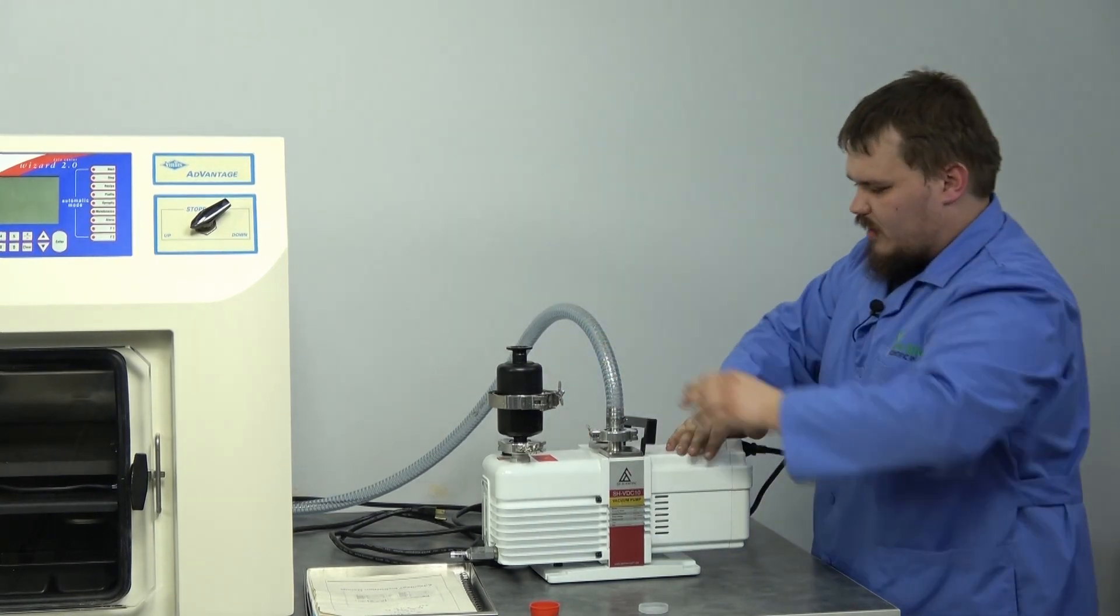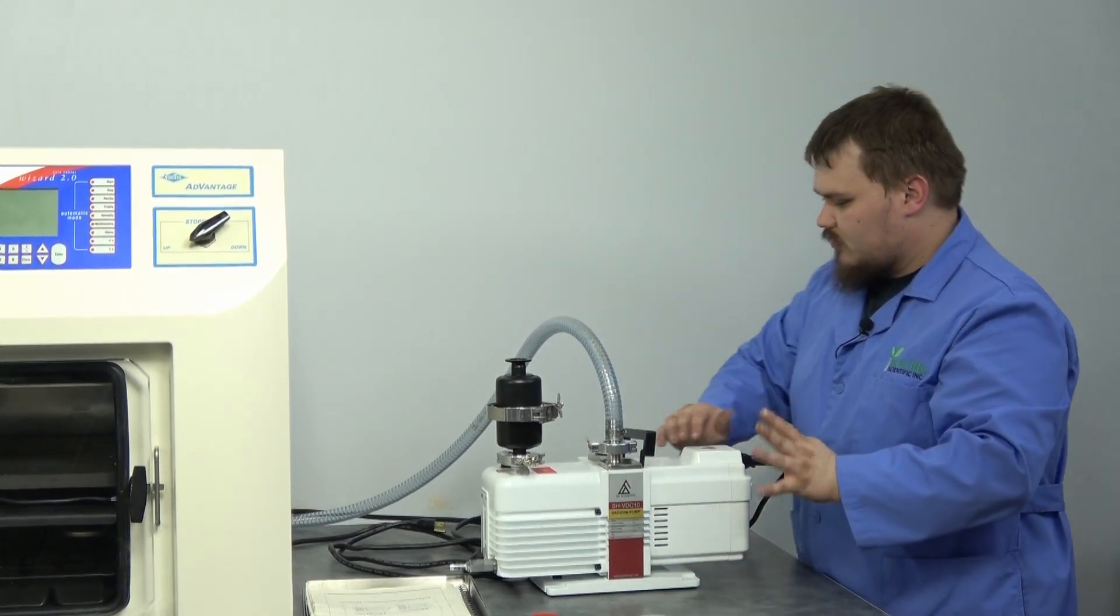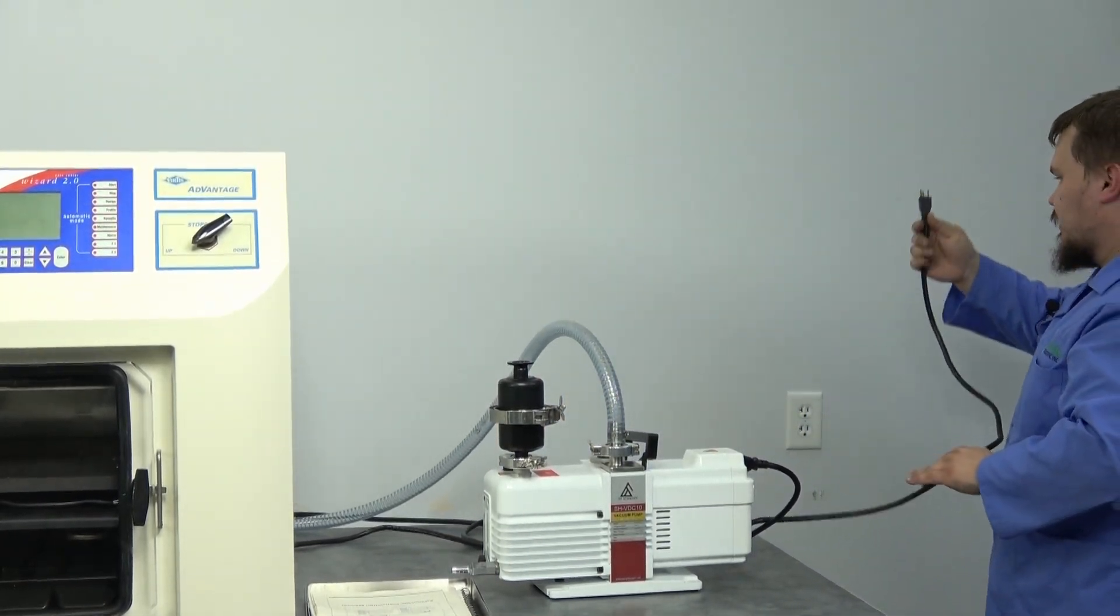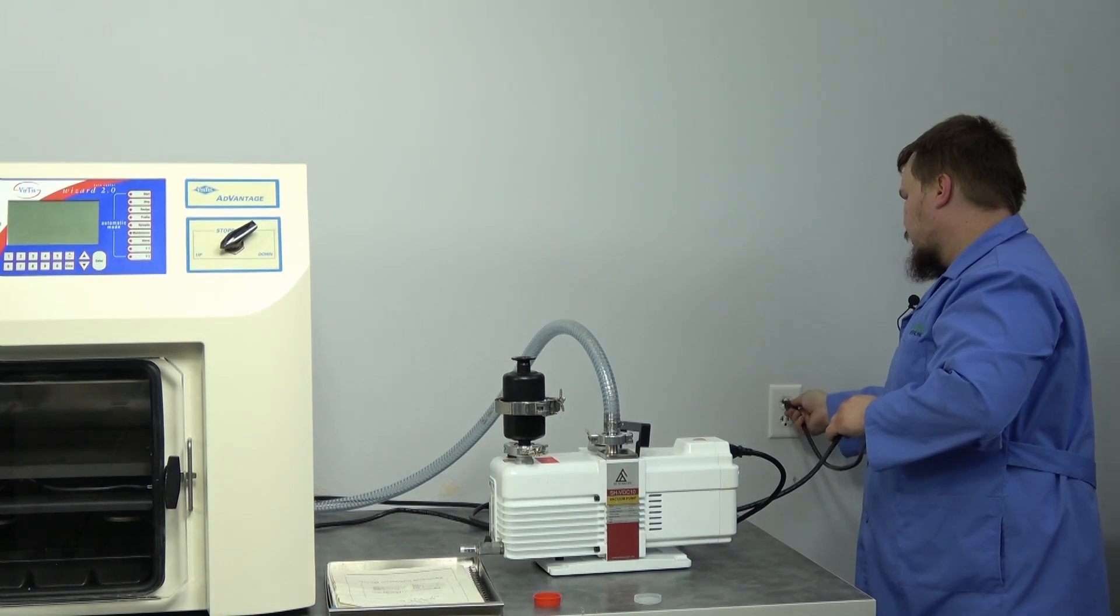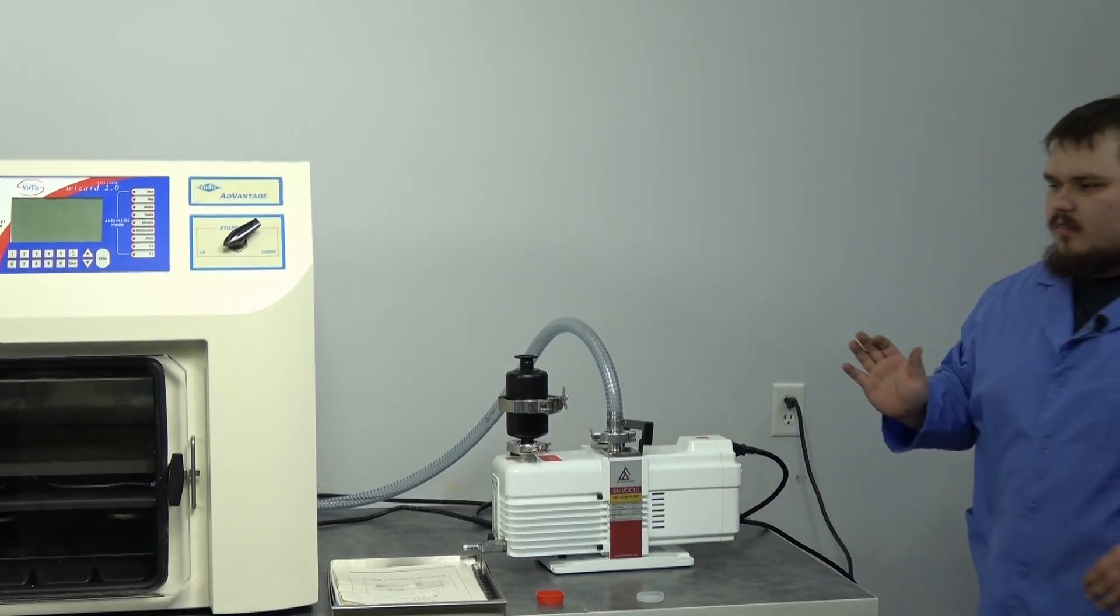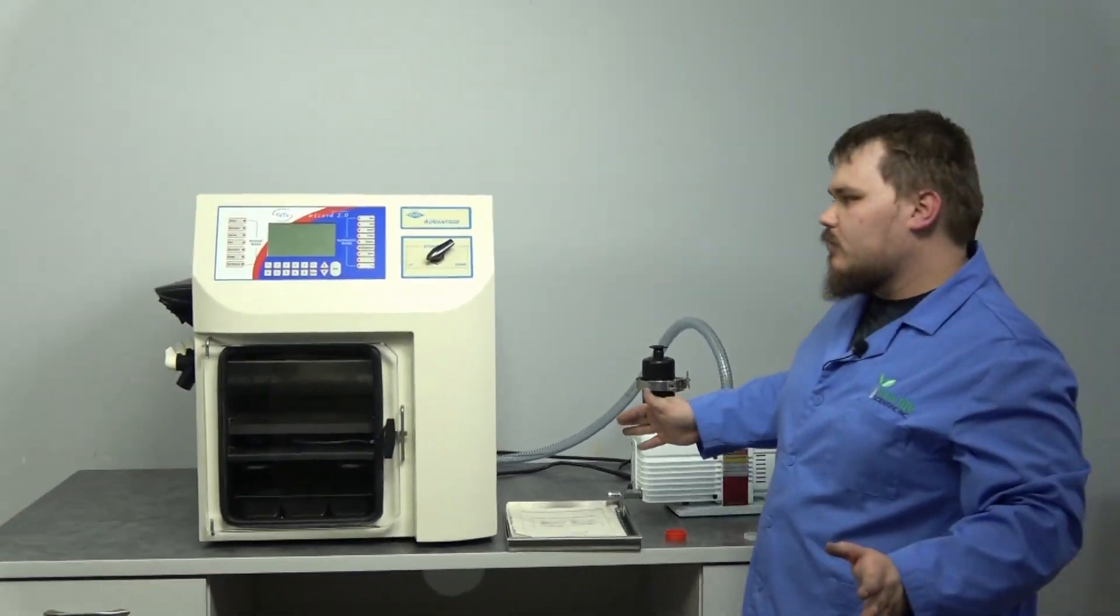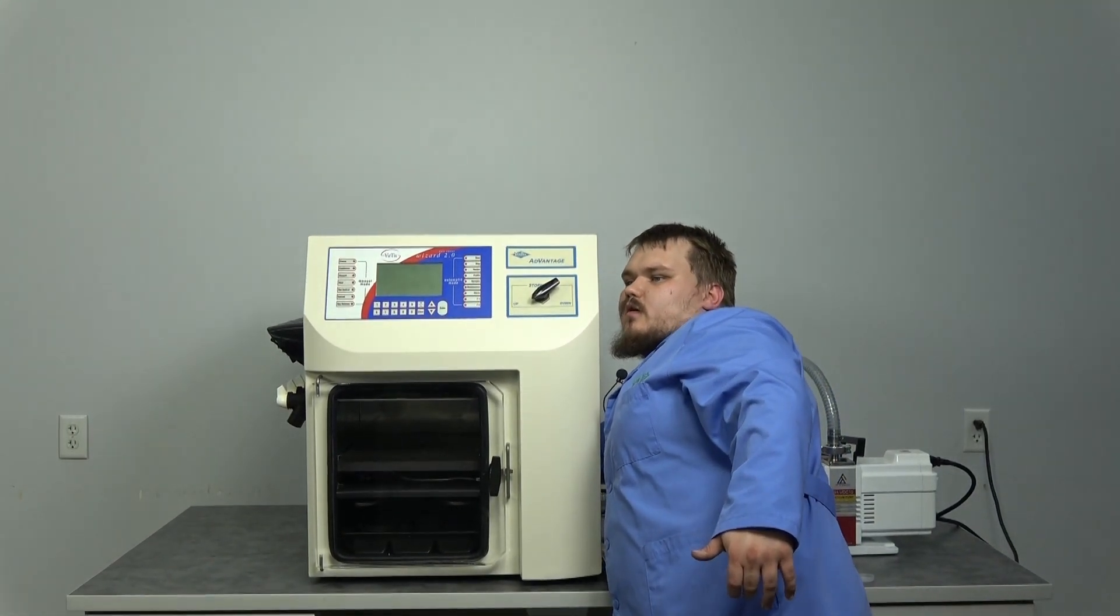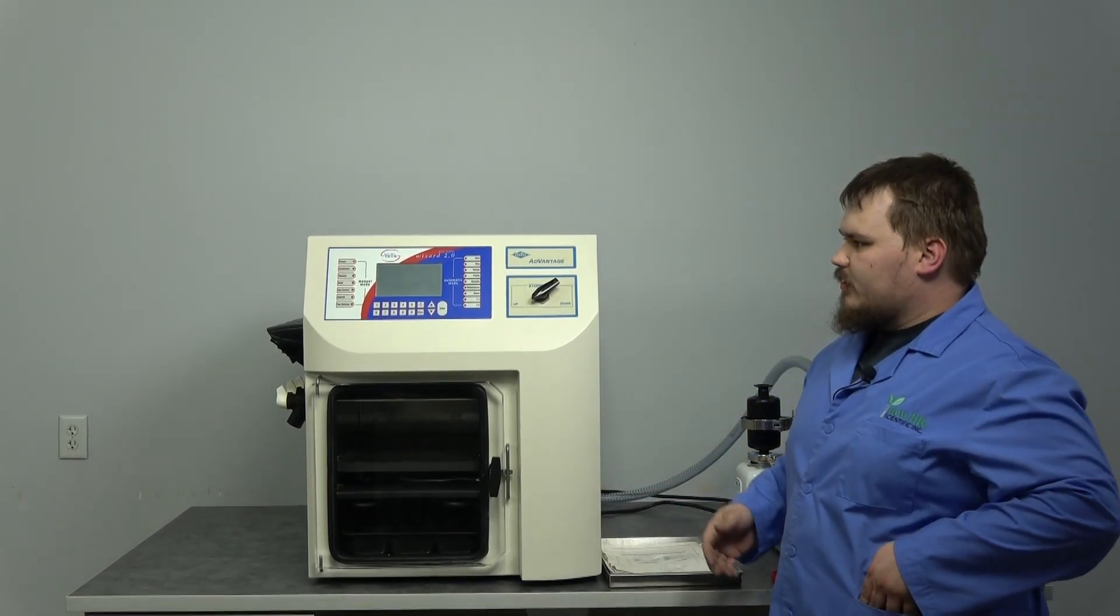From here, this side of the vacuum pump is done, and we're going to connect the machine to the wall outlet. From there, we can reach around the machine and flip the power button.